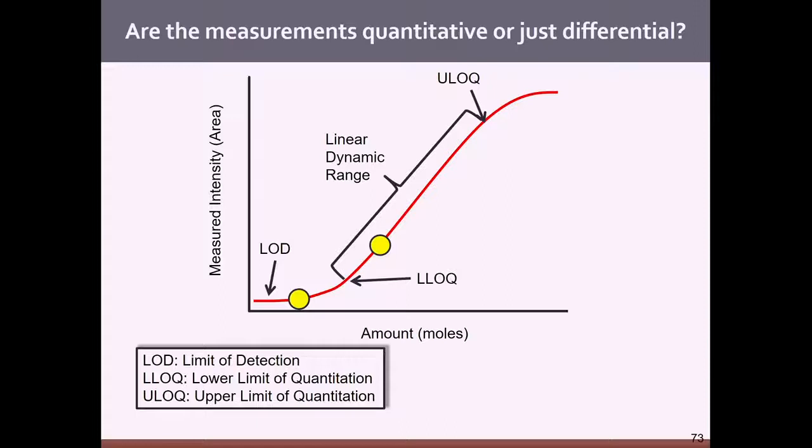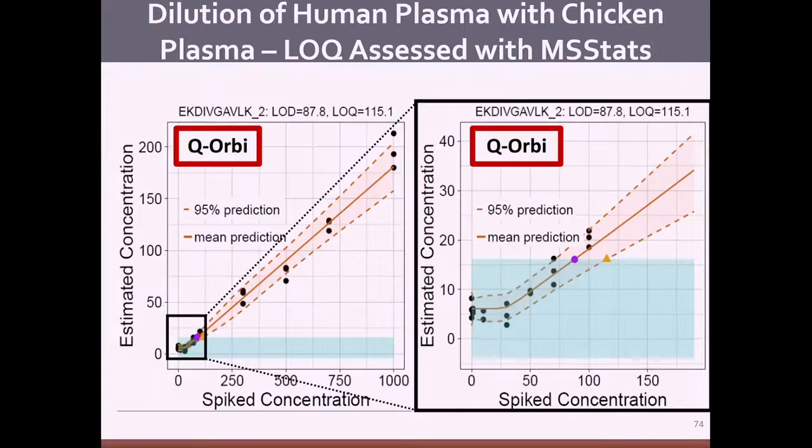And when you start to look at some data from this LFQ bench from the Navarro paper, you'll start to see the evidence at the lower signal intensity. Some algorithms tend to give an underestimate of the peak area. That's because one of the points is below the lower limit of quant. So we do this for every single peptide.